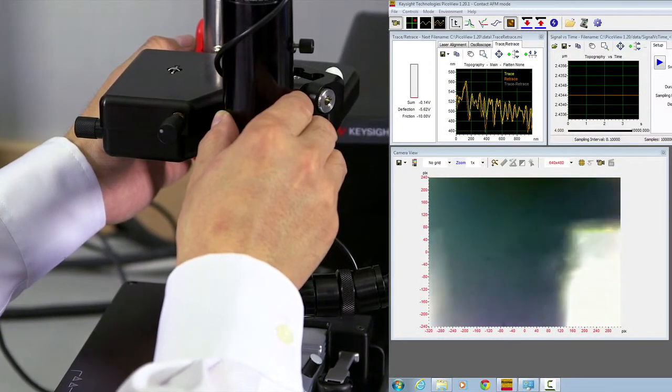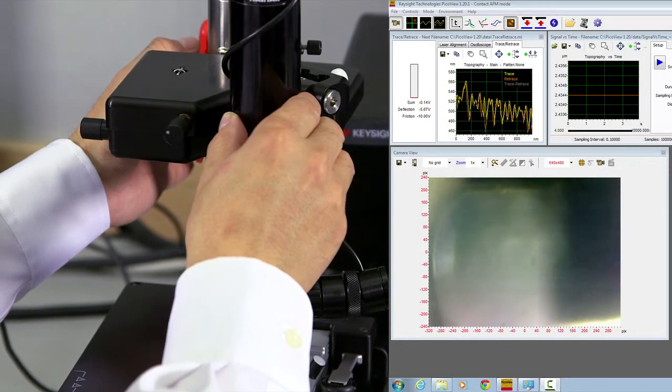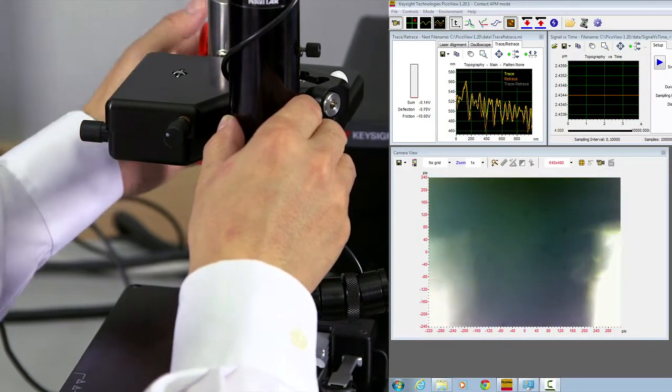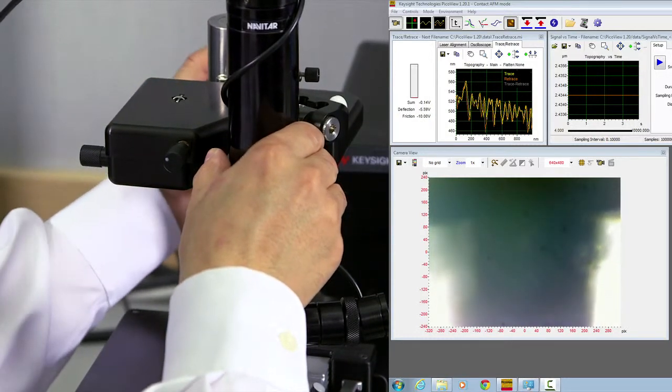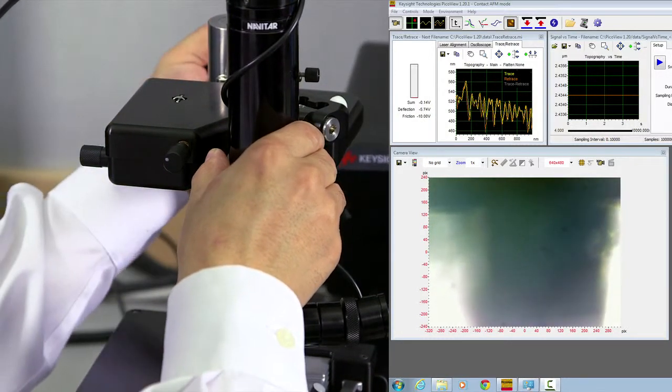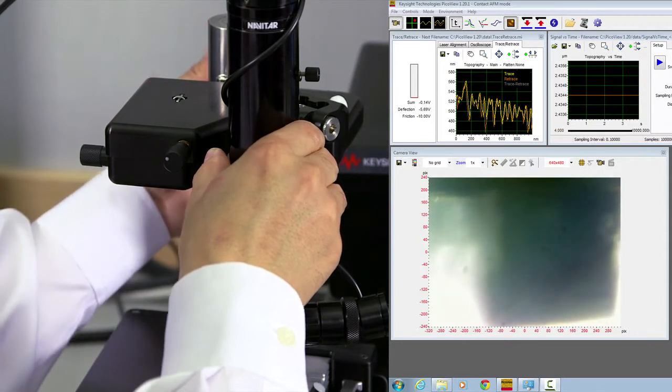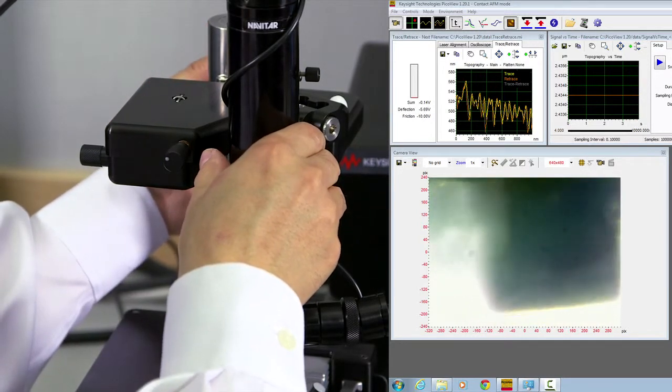Rotate until you can see something. And then turn the Allen key to tighten the set screw until the optical microscope assembly cannot be rotated anymore.